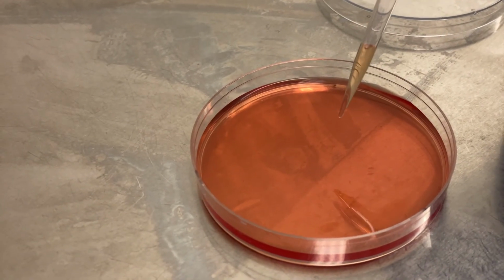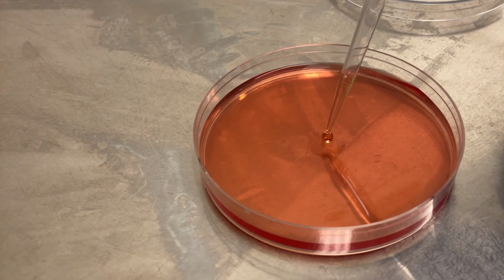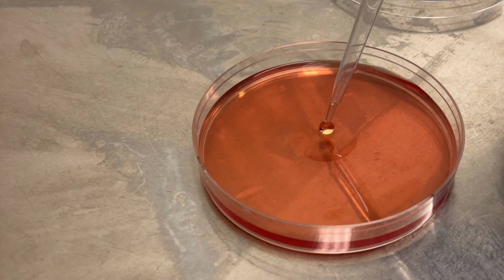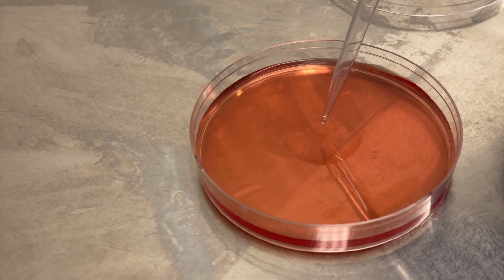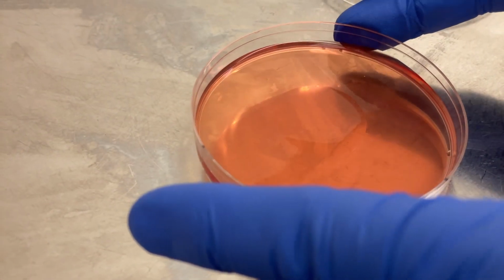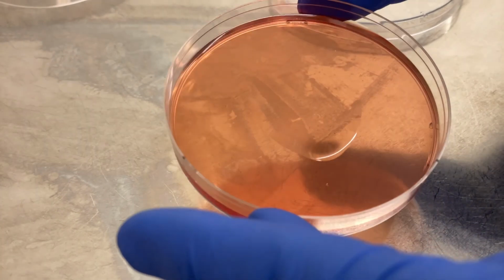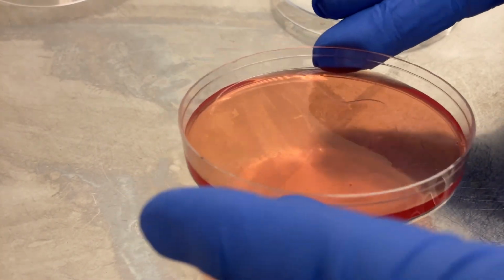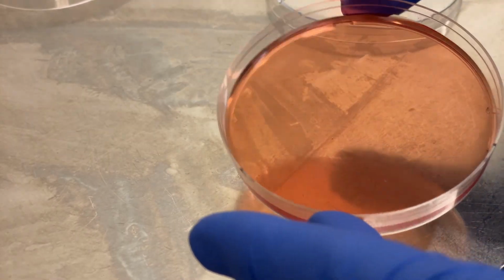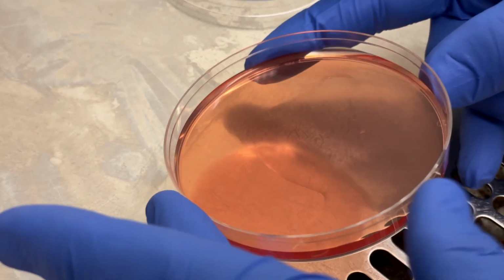In the next frames, we'll show the delivery of a larger volume for the purpose of perhaps selecting antibiotic-resistant colonies out of large populations. This is about 200 microliters, and the idea here is to avoid getting it to the edges, but spread it by this orbital rotation to deliver it to as wide an area as possible.